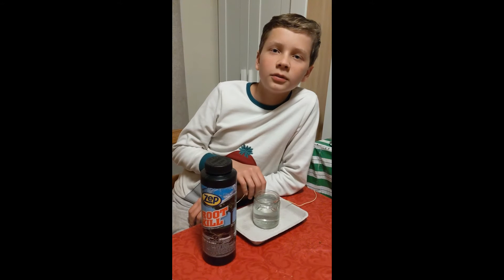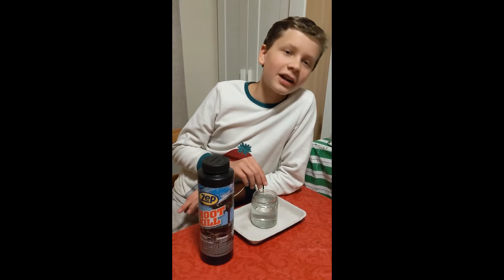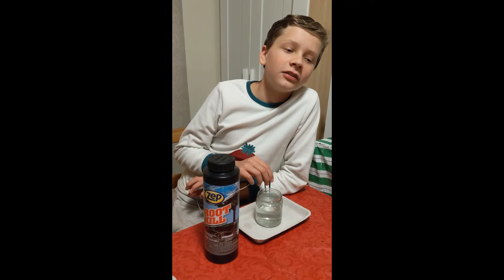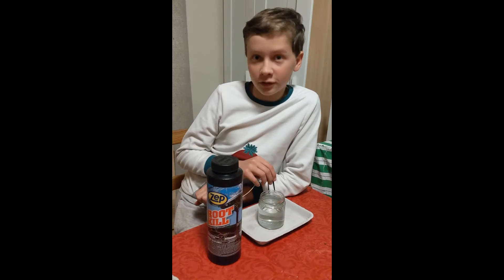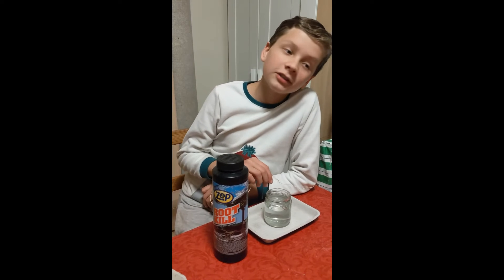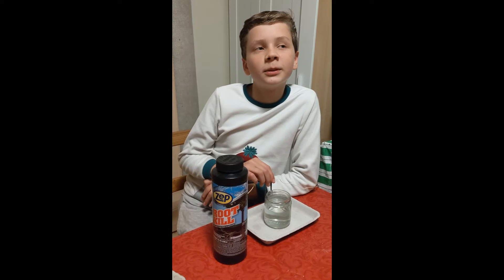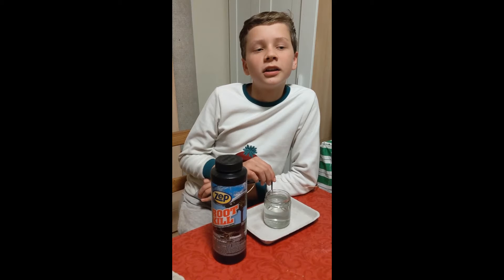I'm doing a copper sulfate and iron nail experiment where I will be submerging an iron nail into water mixed with copper sulfate. My hypothesis is that the nail will turn rusty, and I'm doing this experiment to see how the copper sulfate will change the iron nail.